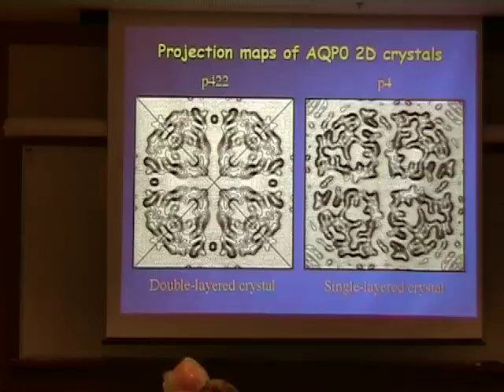So we thought we would use the same trick X-ray crystallographers use all the time, and it has been done in electron crystallography as well, with mutants, namely to try and do molecular replacement and determine the structure of a new protein with the phases of a similar protein. However, this is a little bit more difficult in electron crystallography, because in X-ray crystallography you get most of the data from one or a few 3D crystals. And as you know, in electron crystallography, each crystal gives you 1 diffraction pattern. So you have to merge a lot of different diffraction patterns from a lot of different crystals. And so the merge is always fairly poor. And so it wasn't clear whether this poor merging statistics would be enough to actually do molecular replacement. But nevertheless, we tried.